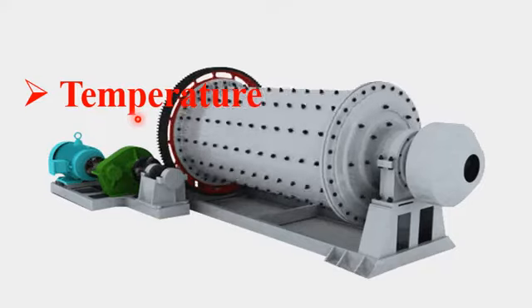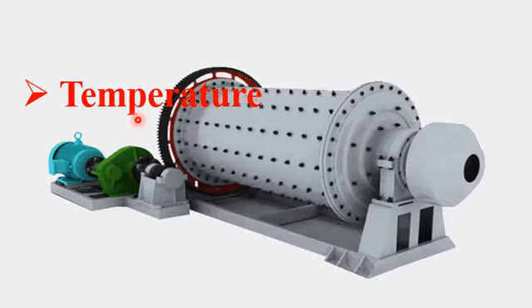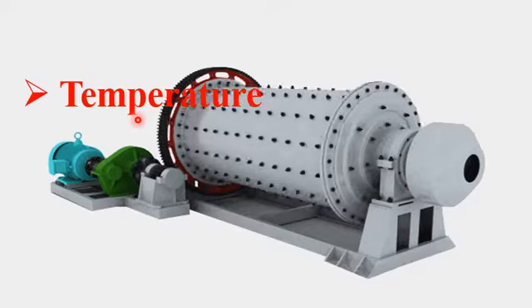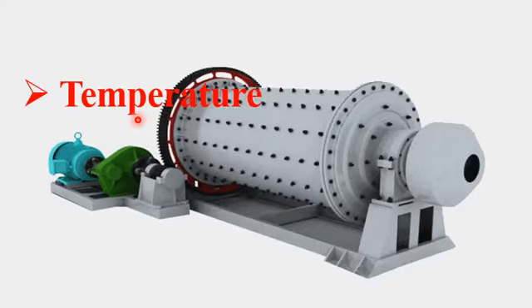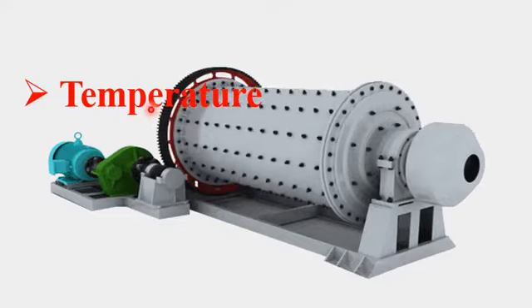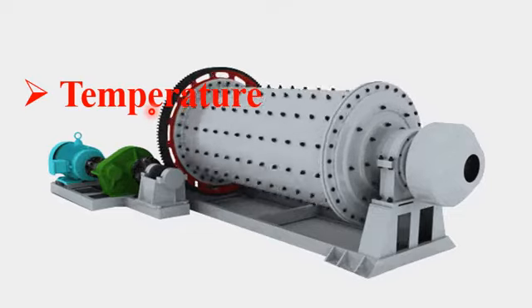When the milling ball and bulk material collide, there is also a frequency with which they collide, so there will be an increase in temperature.